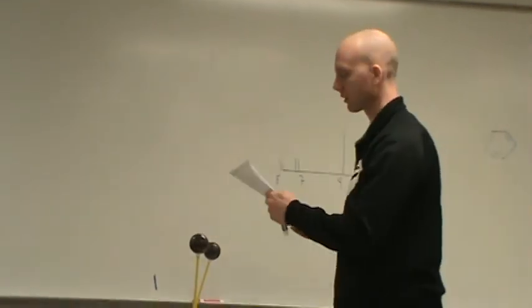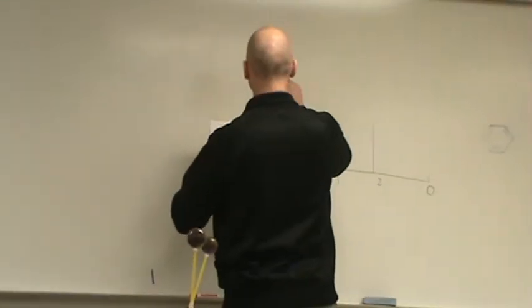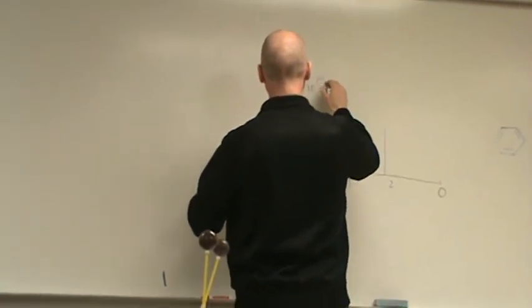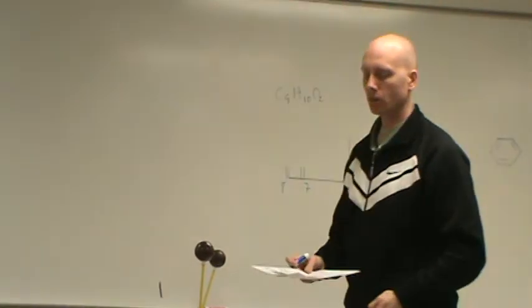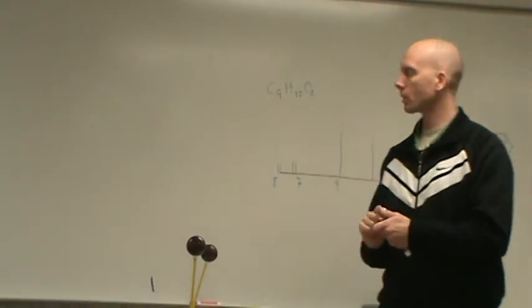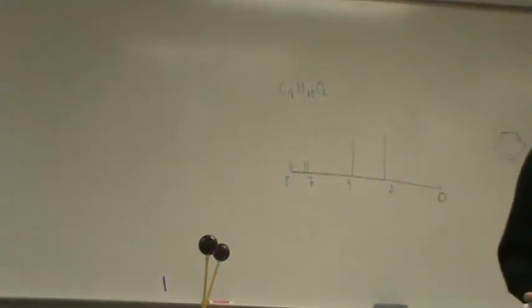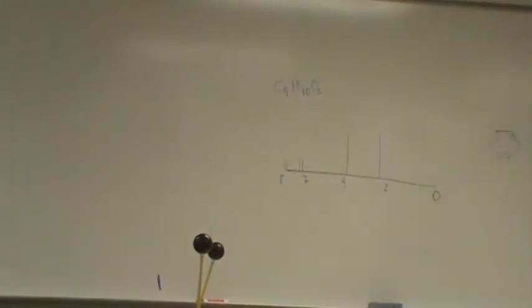If you look, it gives the molecular formula as C9H10O2. See that? So we've used 6 of the 9 carbons. Okay, so I've gotten a lot out of the way, which is nice.